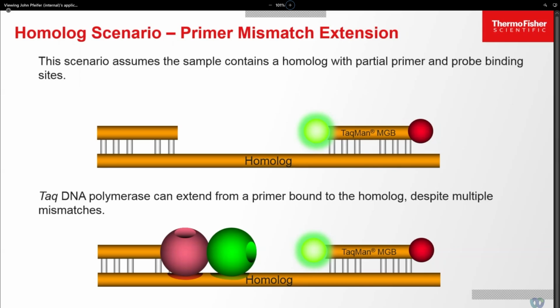Because with primers, we're demanding 2 functions, but those functions are oppositional. On the one hand, we're certainly hoping for specificity. We always want that. But at the same time, we demand that primers provide a 3' hydroxyl, and that hydroxyl is an opportunity for the polymerase to extend a mismatched primer and stabilize it. So you see how those 2 functions are fighting each other. That's just the nature of primers. That's the way that works. Okay, so we can say then that Taq polymerase can mitigate the effect of mismatches in a primer binding site.